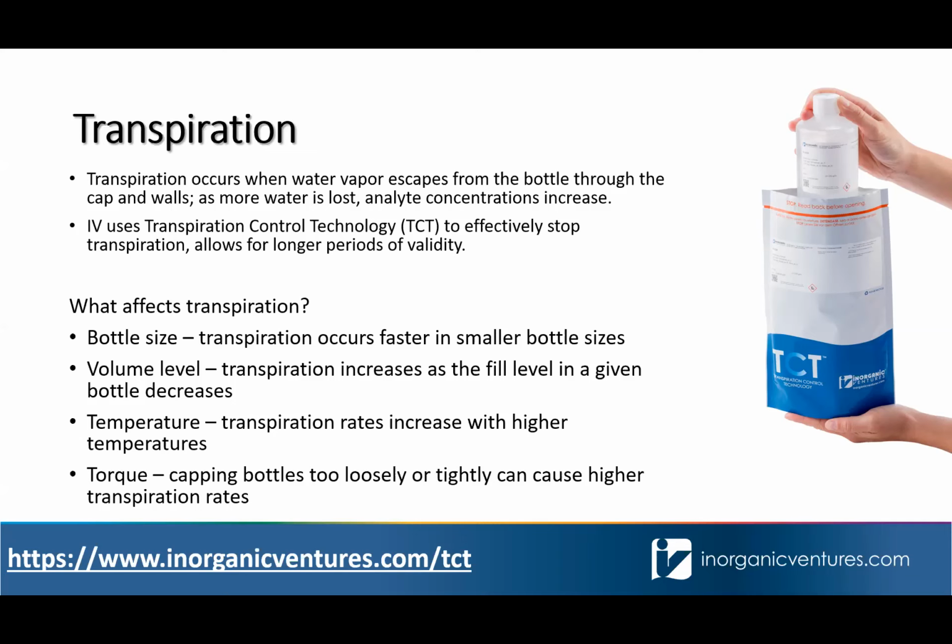So issues affecting transpiration. So one, bottle size. Smaller bottles we found transpire faster than larger bottles. Also the fill level of your solution. So as your fill level decreases, the rate of transpiration will increase. Temperature, I mentioned that 20 plus or minus 4 is the usage temperature. So as temperature increases, your rate of transpiration will increase.